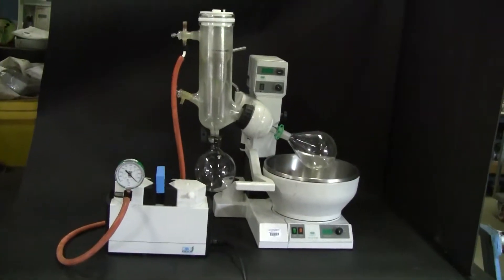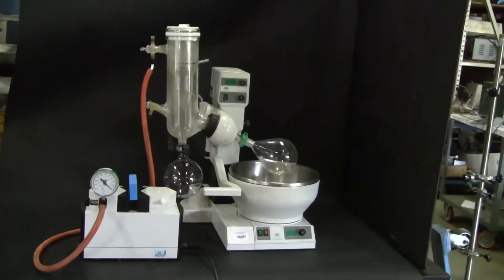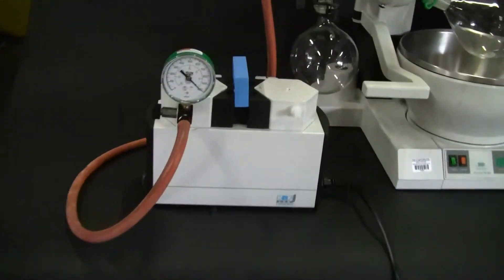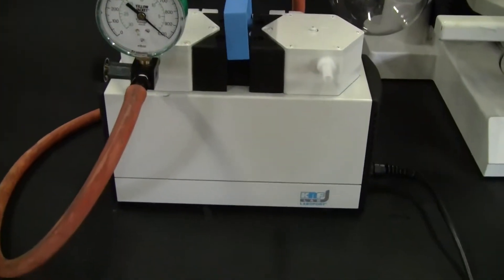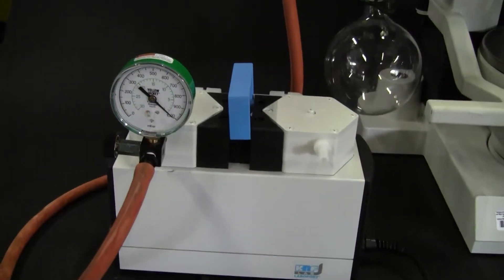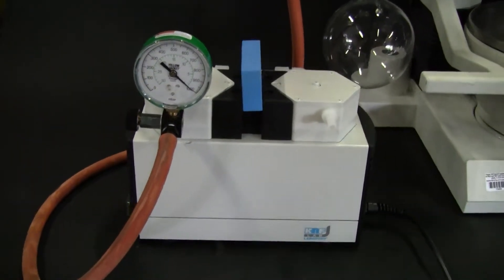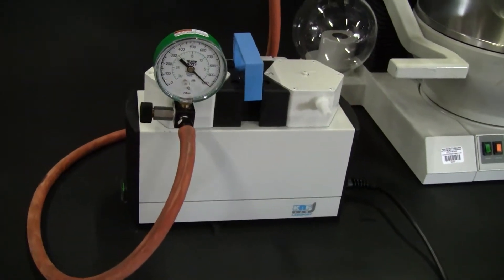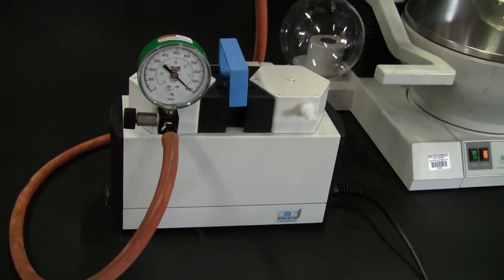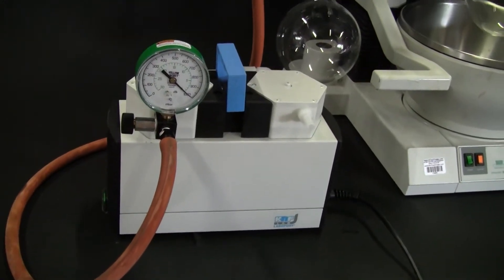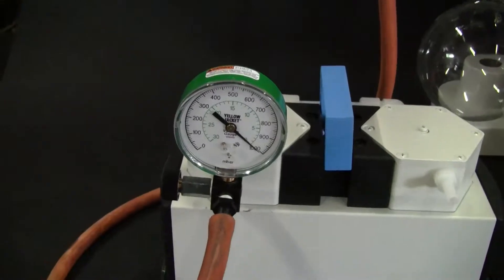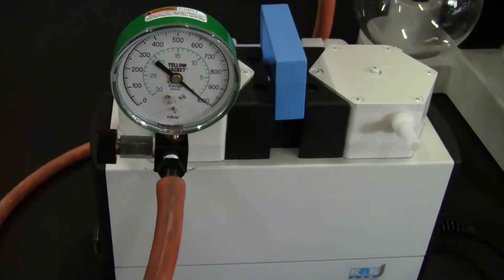Hi, this is Michael Natal from HitechTrader. Today we are looking at a KNF Dual Diaphragm Vacuum Pump, UN820.3. This is approximately 6 torr, I'm going to say 10 millibar vacuum pump. This pump has a vacuum gauge and needle valve that came from KNF right on it.